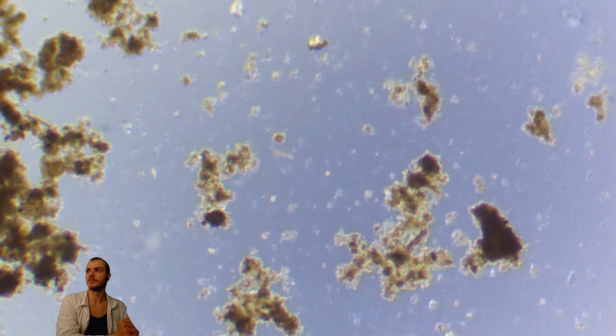Commonly in mycelium, you cannot see it clearly, as it is made from multiple cells most of the time. So I'm not sure if this is mycelium, but it is too big to be a bacteria colony. So yeah, I will bet for mycelium.